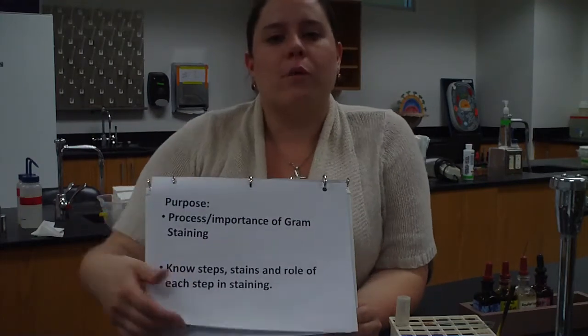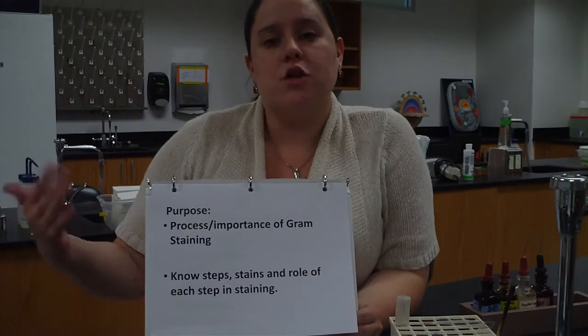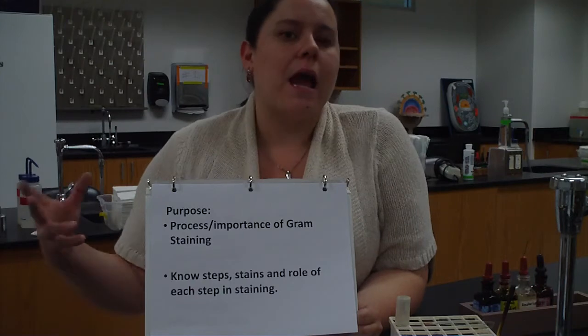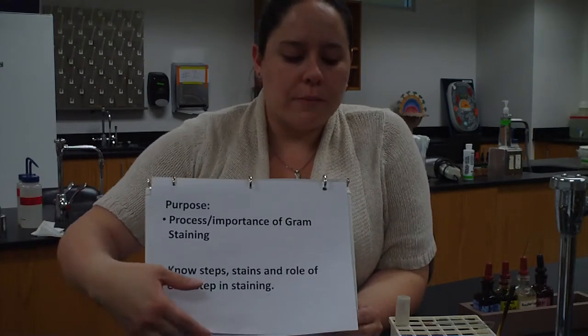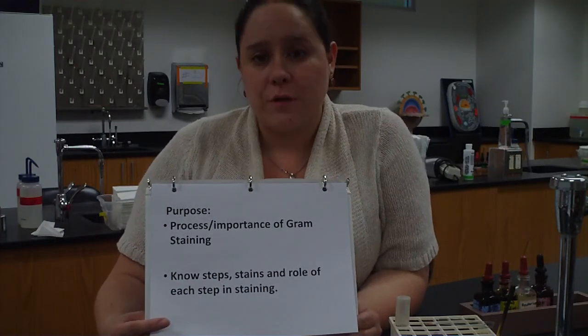In this particular lab, we want to stress the importance of gram staining and the process of gram staining, and as you read through your lab, you should be able to find a little bit about the history and where gram staining comes from and why it's so important. The other thing is we want to know the steps of gram staining, so you want to make sure that you know all the different steps.